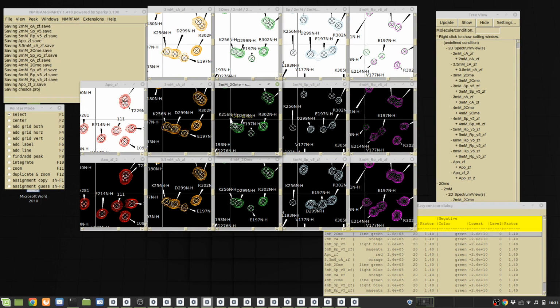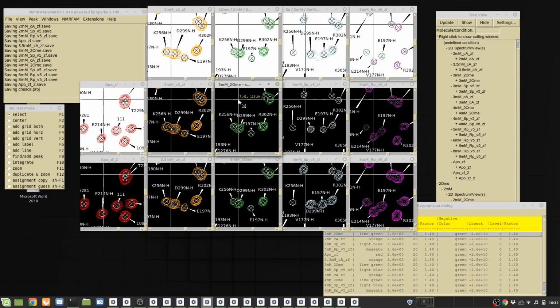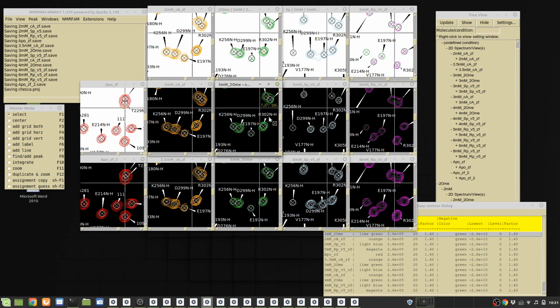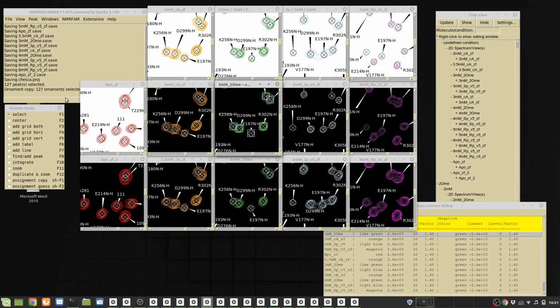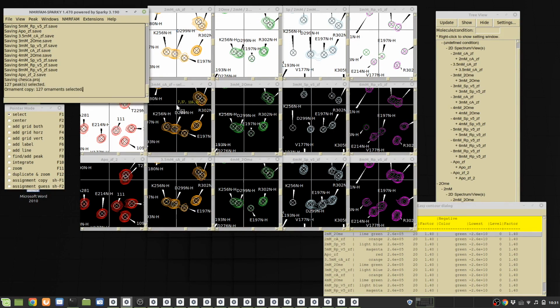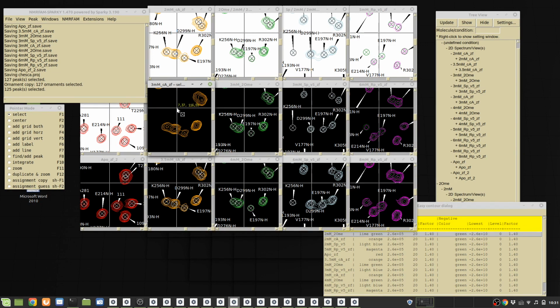So also the control-associated one-key mode is now a lot like Office or Word or more general tools. So you can select all the peaks by Control A, Control C. It works as Control A for the Office programs. You select everything, and Control C is going to select and copy everything. You can paste onto the other experiment using Control P. So let's say if I delete all the peaks in this window, I did Control A and delete.